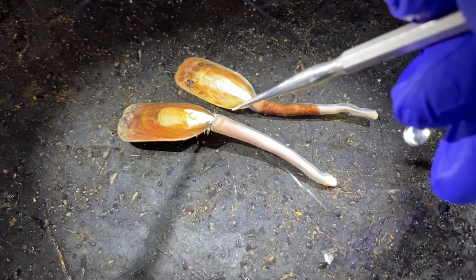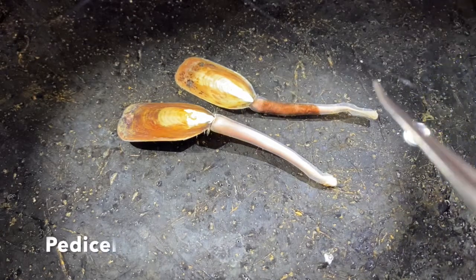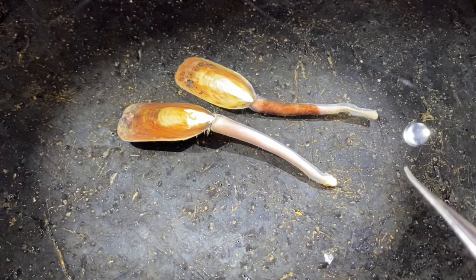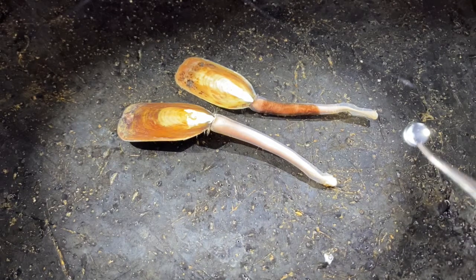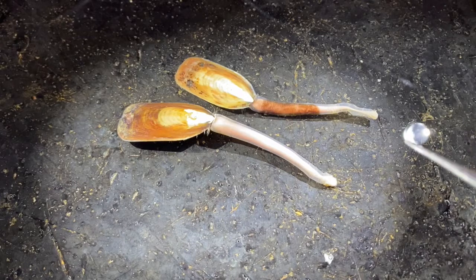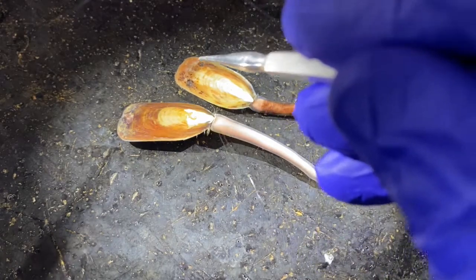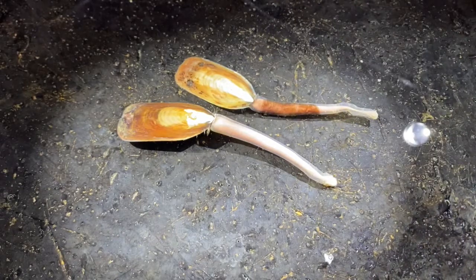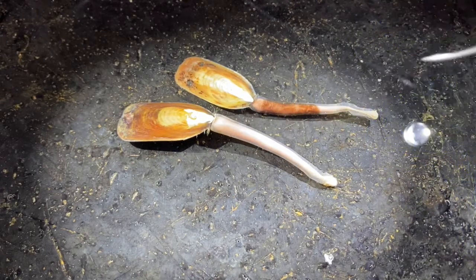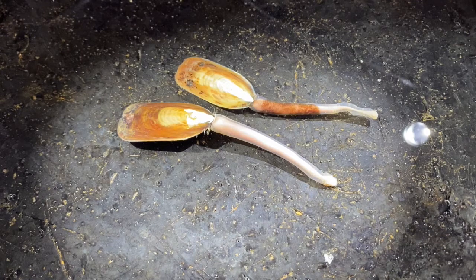So this structure down here is the pedicel, and it has a cuticle, this transparent portion, and it has muscle that extends all the way down to the base. Now these lingula are interesting compared to most other brachiopods because these are typically found, in fact, they require a soft sediment. And the pedicel is anchored in the soft sediment. In fact, all the way down to about this uppermost portion of the shell is below the surface of the substrate. If you were to do a cross-sectional cut through the pedicel, what you would see would be an outer ring of the cuticle, an inner ring of muscle, and then a lumen or a tube that runs the length of the body of that pedicel.